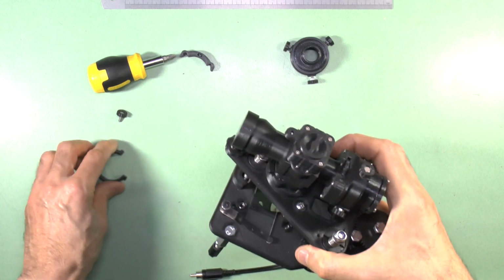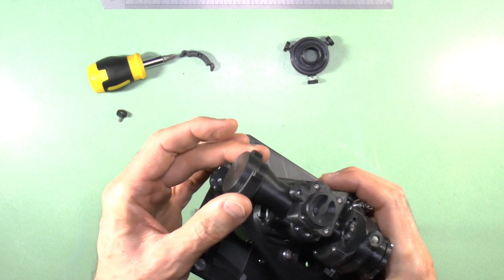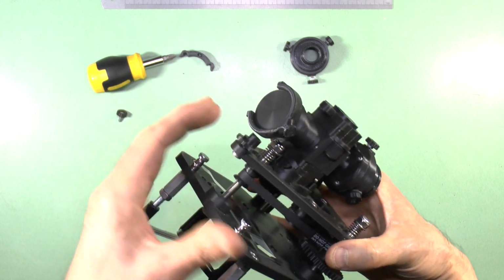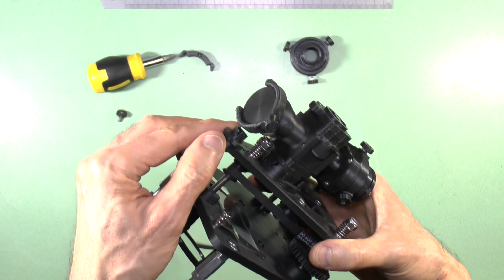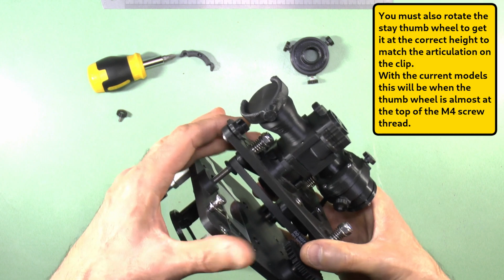Put the clip module over the expanded part of the Epi black body with the articulation facing off to one side. Then rotate the clip and stay thumb wheel till the opening of the stay thumb wheel is level with the articulation of the clip.